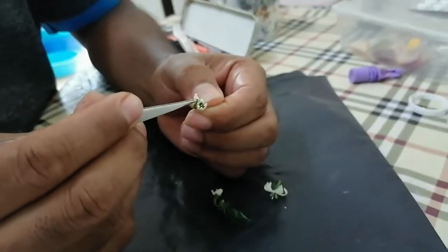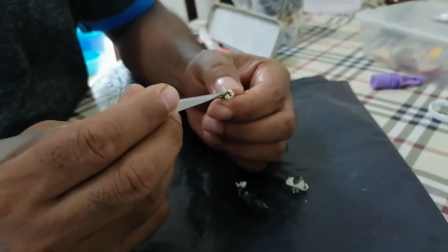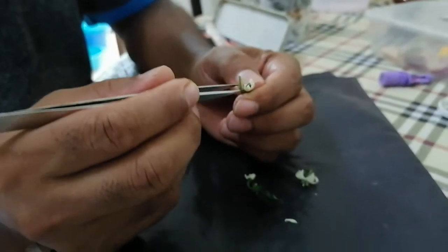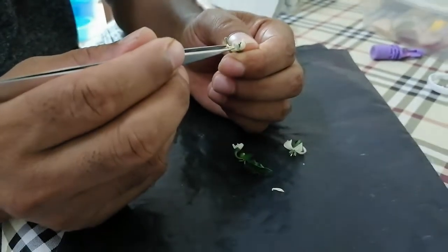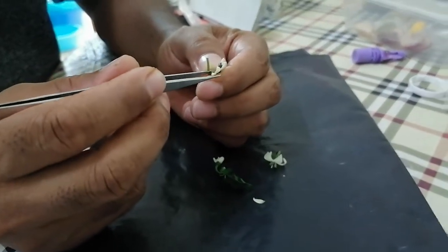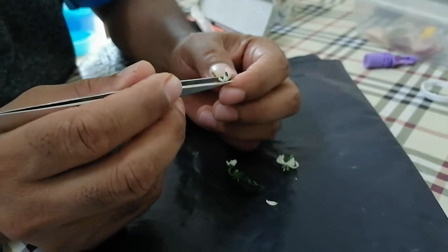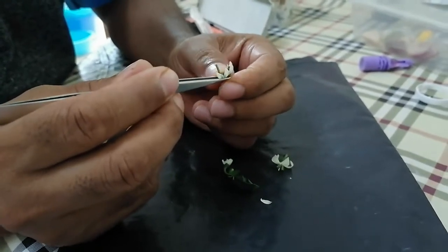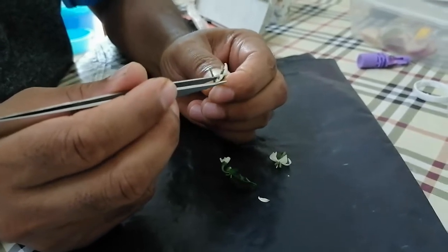This is the petal — they have five petals. I'll show you: this is one petal, this is two. The problem is that while we pick it up, the anther also comes out altogether. I will show you the anther and all the petals together.